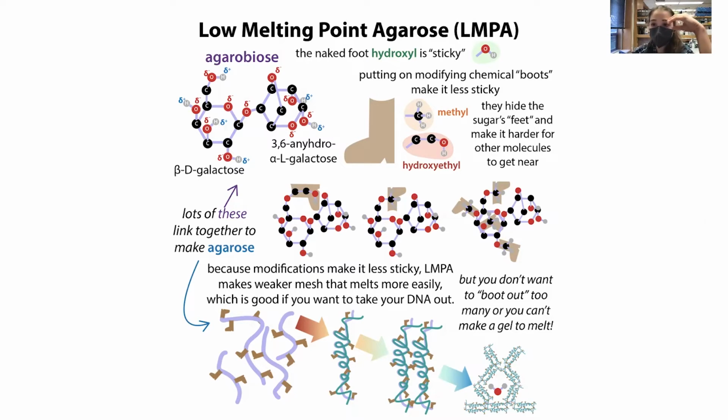To do that, you cut the gel around the band. You run your gel, you see the band, you cut around it. Often this is done with great care, because of the UV, so you have a box and use caution. But you cut around the band and then you want to get the DNA out, so you basically want to melt the gel.